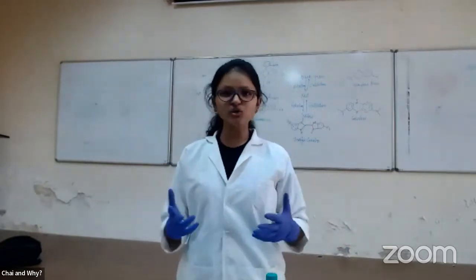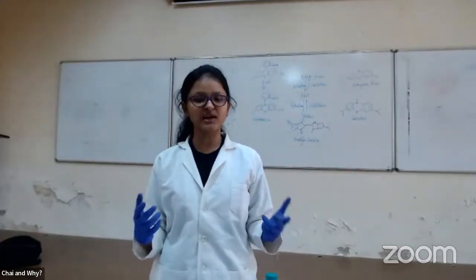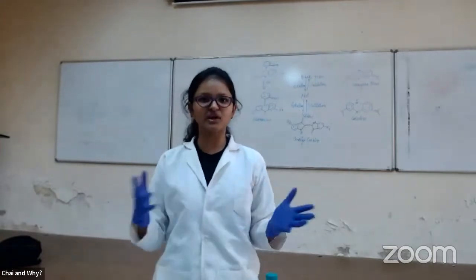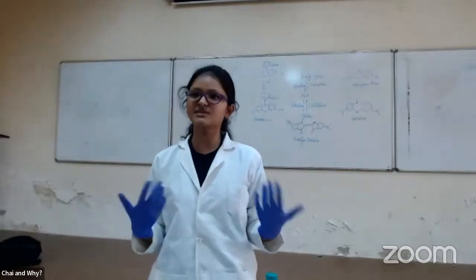So I'll show you how I can change the color of these compounds and what significance I have out of it. Is it just for fun that I am doing this, changing the color? Or am I making some sense out of it?